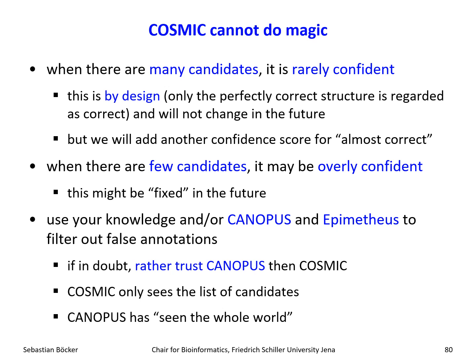But then there are other means, and as I said, Epimetheus will be available shortly to filter out wrong annotations, incorrect annotations. So if you notice that the structure that CSI FingerID assigned and that Cosmic told you has very high confidence doesn't agree with the compound classes that Canopus assigns, then trust Canopus. Don't trust Cosmic.